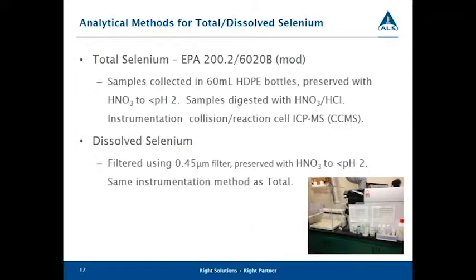So now to some of the challenges analytically that you can come across with selenium, and how typically analyzing for total and dissolved selenium differs from speciated selenium. So total selenium is often analyzed by ICP-MS, so inductively coupled plasma mass spectrometry.